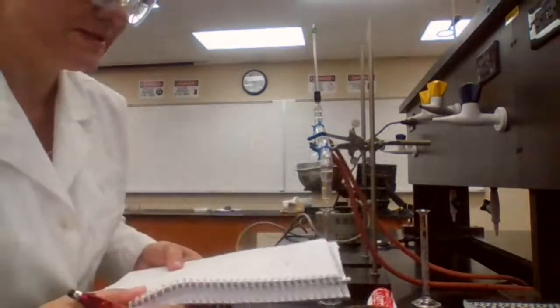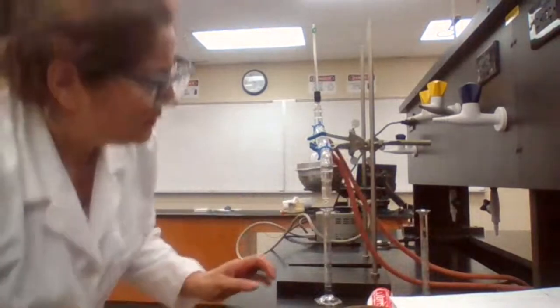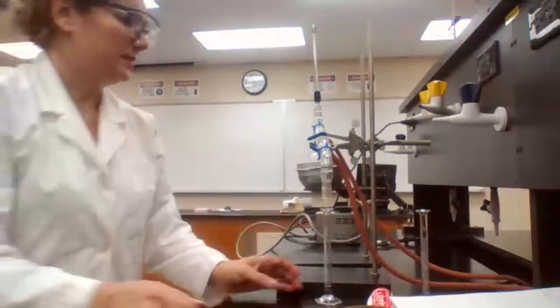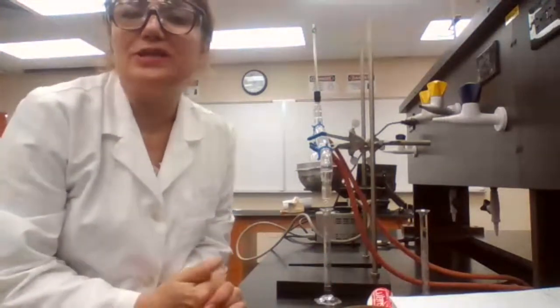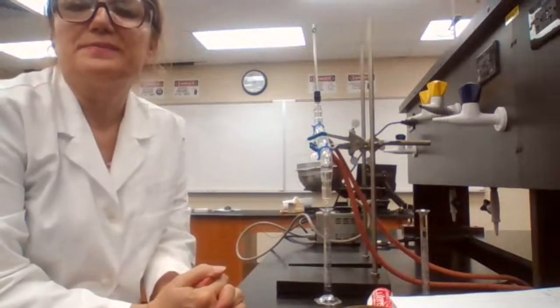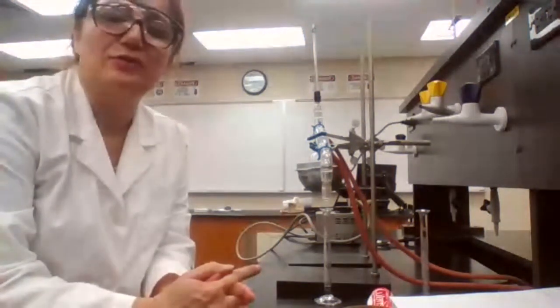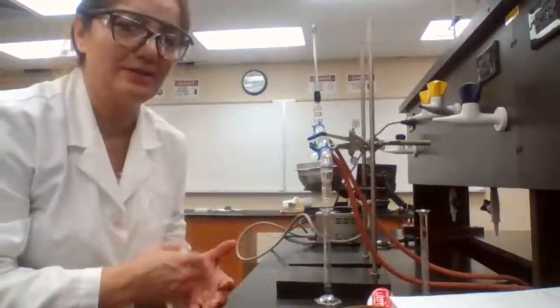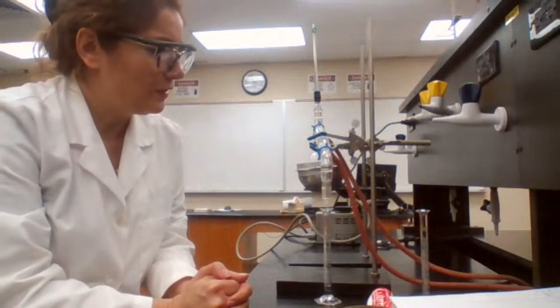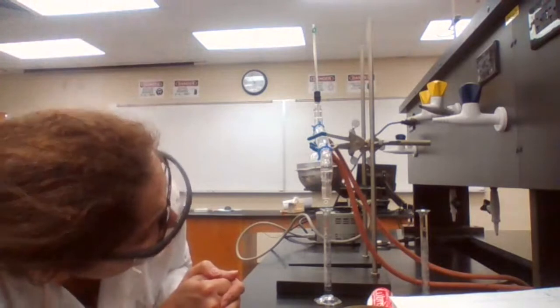Ideally, which one is better, fractional or simple distillation? For separation purposes, it's going to be the fractional distillation. And why is fractional distillation better? We have to explain the process of fractional distillation, how it discriminates, and how the impurities are going to be left behind.